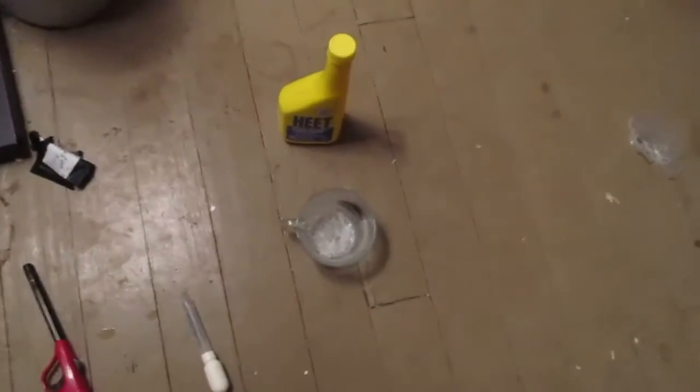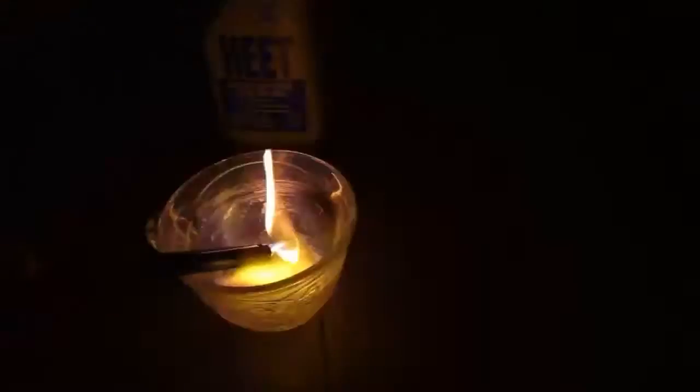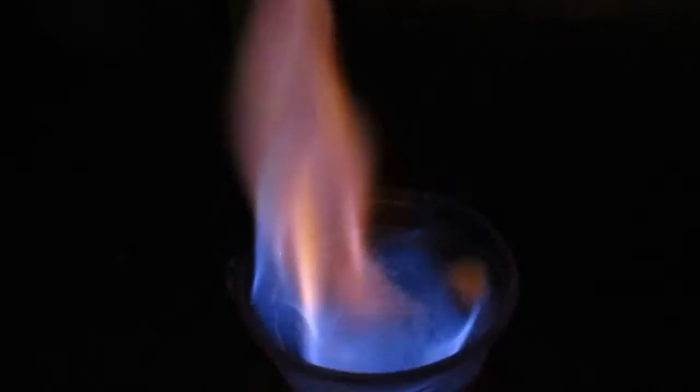Now we'll light it on fire and I'll turn off the lights — so it's dark in here. If you look in there you should be able to see some crimson red. Yep, there we go — so those are lithium ions.